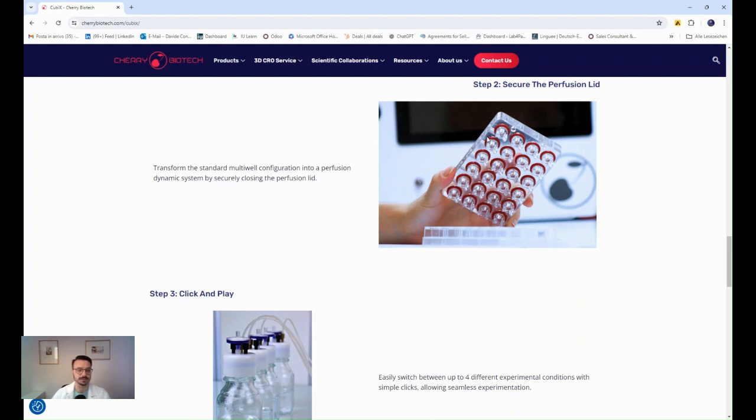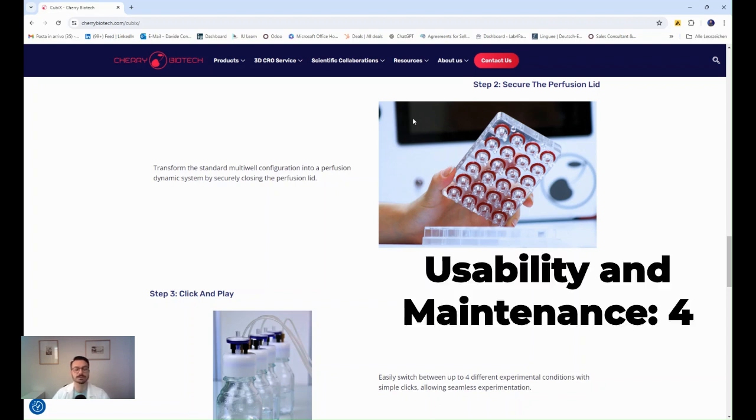And then obviously this, especially the fluidic one, is also dependent on a device. So you would need to make sure to have a good communication understanding with them, because you want this to be running all the time. But in general, it's a really good system, so I would give it a solid 4.